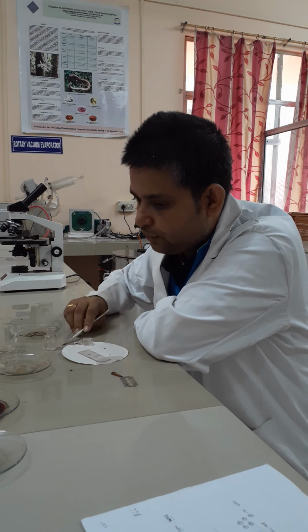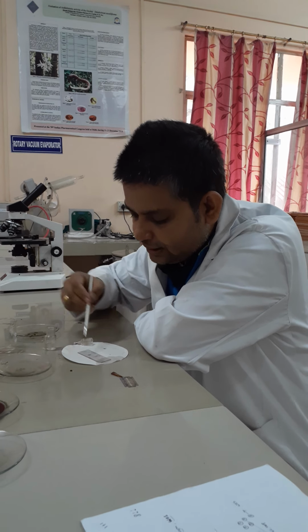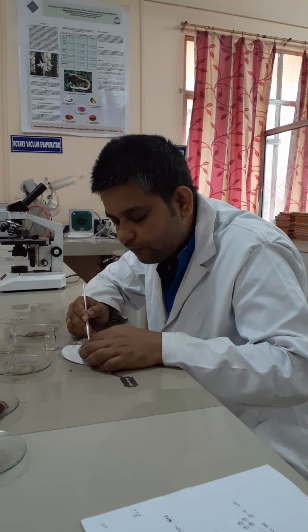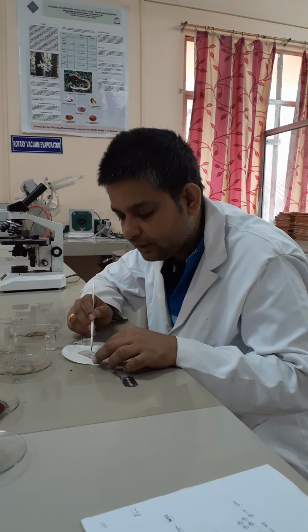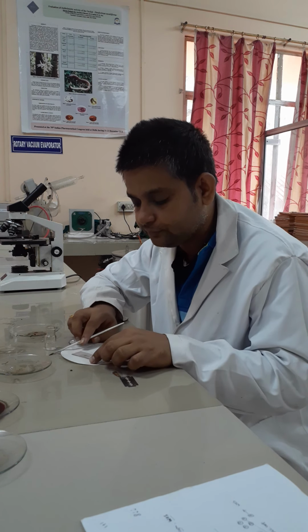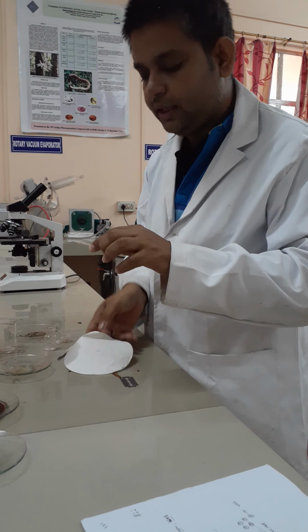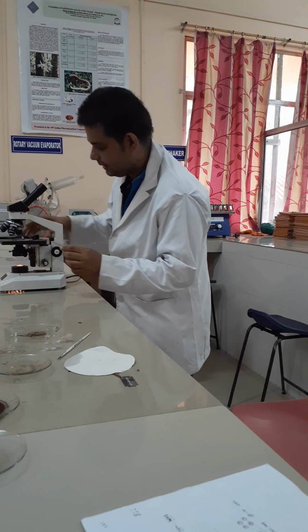Now you add 1 or 2 drops of glycerin over it. Glycerin will prevent further drying of the slide. Now put a cover slip over it. Take care that air bubbles should not be there while placing the cover slip. Now you wipe out the excess reagent from the base as well as from the top. Your slide is ready now. Now place it under the microscope. Let's see how the cellular characters look.